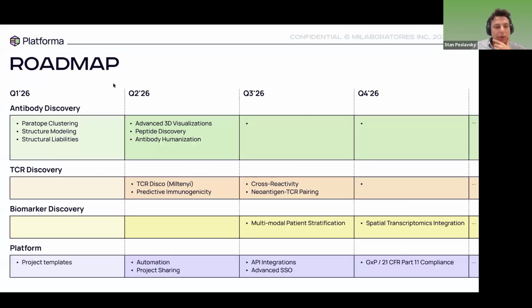While you're answering this question, I just wanted to mention that we are working a lot to push for the best antibody selection approaches on our platform, both for in vivo and in vitro. Today I showed how we can use paratope clustering to select and diversify our lead panel, and sequence-based liabilities to de-risk this panel early.